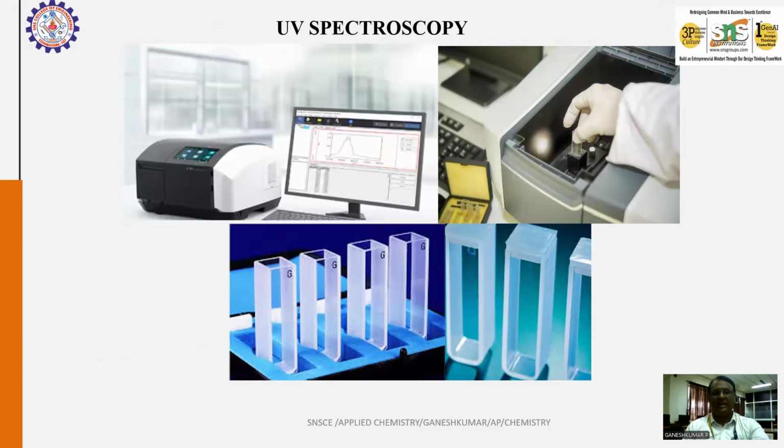Here in this picture, we can clearly see the instrument of ultraviolet spectroscopy and how it gives the output in a graphical form that is observed on the monitor. These are called cuvettes, which are made of quartz material, and they are the sample holders.